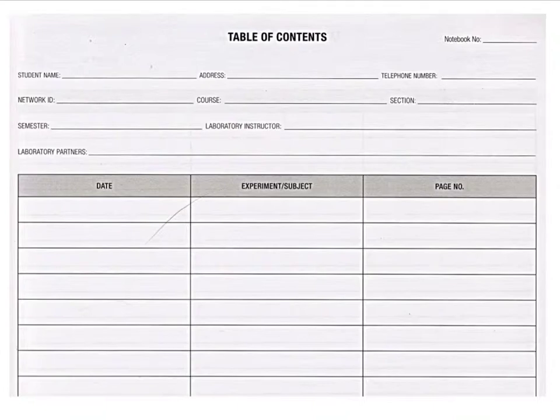The first page you'll notice when you open your book is your table of contents. This is a good way to keep track of which lab is where. Also, if you happen to lose your lab notebook, make sure that you put in at least your name, so if the office gets it, they can at least return it to you. Otherwise, if you don't end up being able to get it back, it's going to cost you another $10.